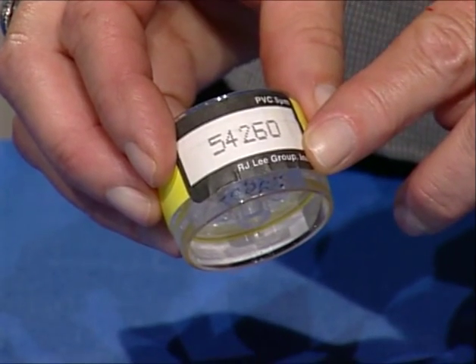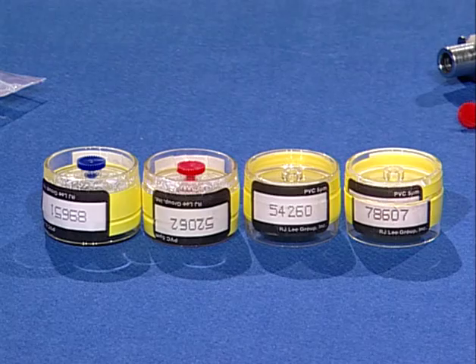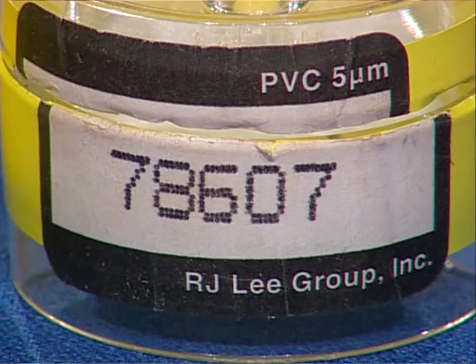Each cassette has a label with a series of numbers. These numbers identify the specific cassette, and the laboratory has a record of the weight of the specific filter contained within the cassette. We will discuss this further when we talk about sampling, but for now you will use this number to describe your sampling event.